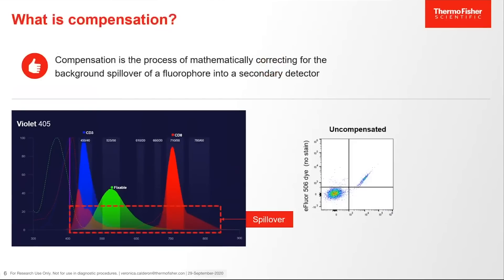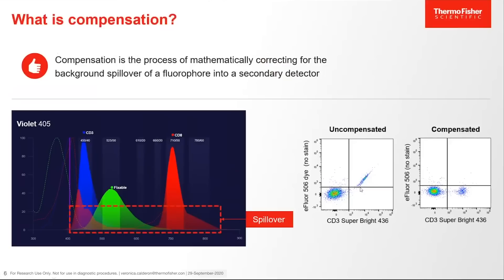What is compensation? Compensation is the process of mathematically correcting for the background spillover of a fluorophore into a secondary detector. Looking at the same markers on a spectral viewer from before, the plot on the right is uncompensated data. But when compensation is applied, the signal is removed from the secondary detector, and only the signal from the primary detector is seen.